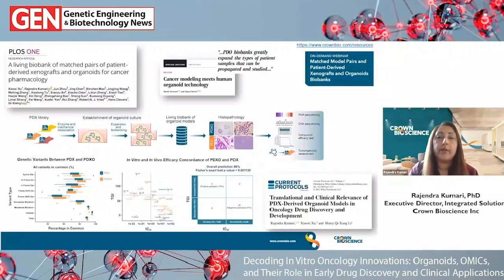Now, generating those biobanks of large numbers of tumours is really important here, because that will then capture that patient diversity for drug discovery and screening. So in this paper on the left-hand side, we actually describe the methodology for creating the organoids from our PDX models, and then biobanking and characterizing these. Now, the self-renewal capability of stem cells means that you can indefinitely expand organoids in long-term culture, but still maintain that genomic stability, which again is shown by the graph on the bottom left.